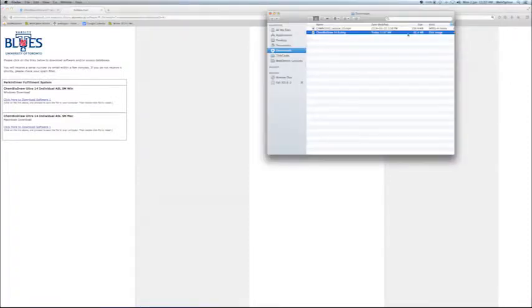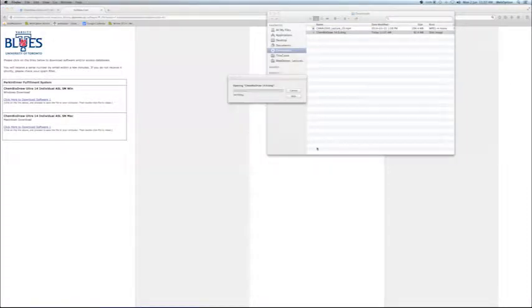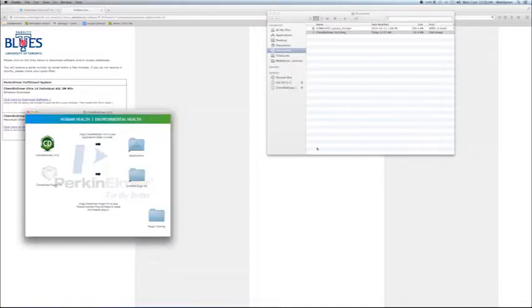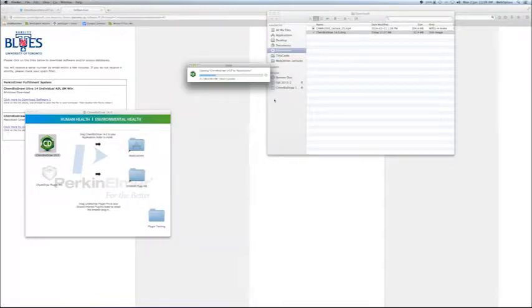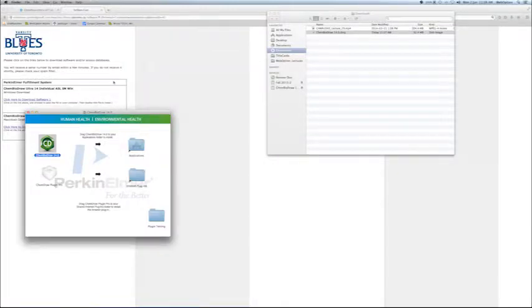After you have successfully downloaded and installed the software, the final step is to activate the software. When you start the download process, you should receive a serial number by email within a few minutes. If you do not receive it shortly, please check your spam filter.